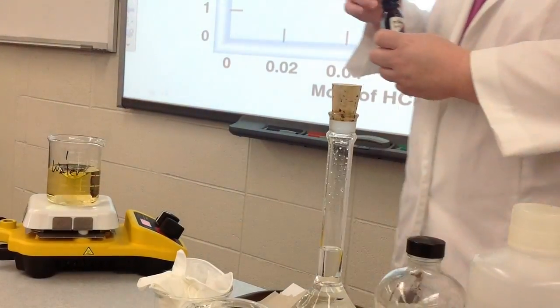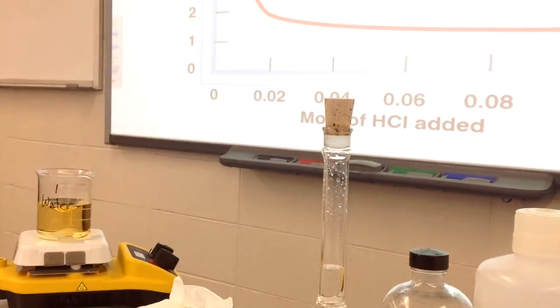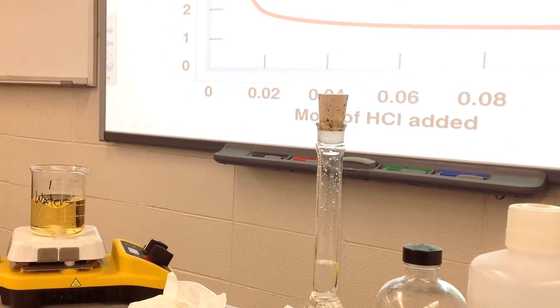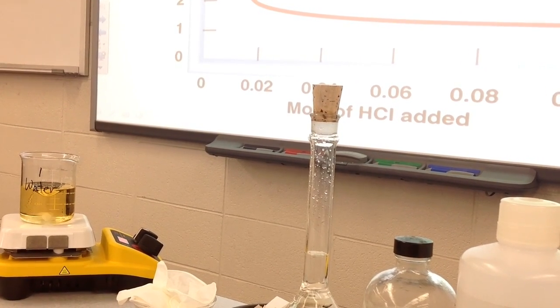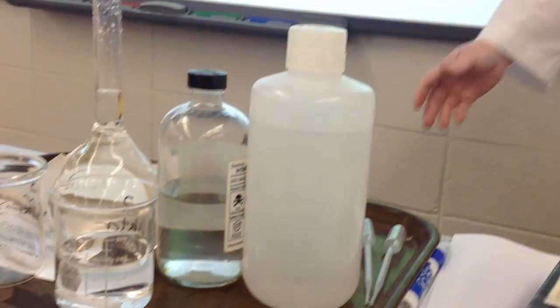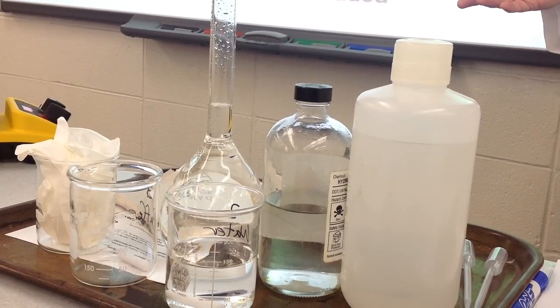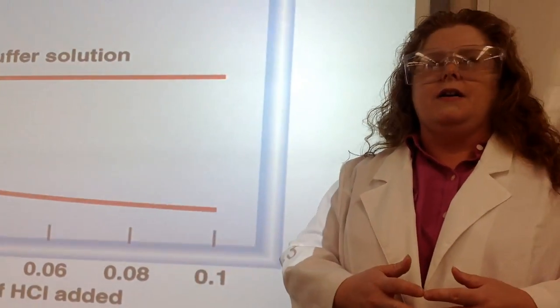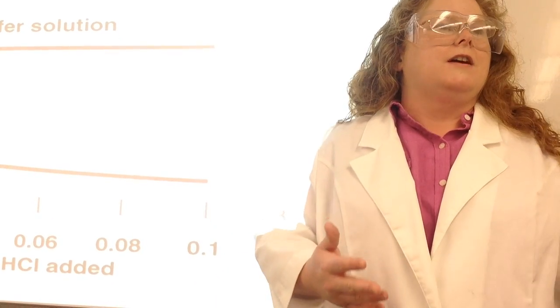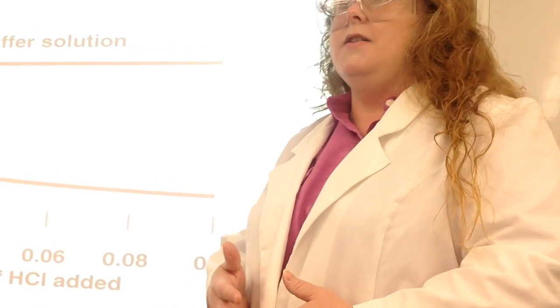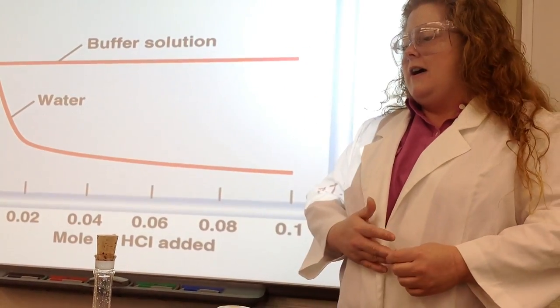You notice that the water now is yellow, and what would you guess the pH of this water would be right now? Okay, it probably is about five and a half right now. This is distilled water, but it has sat open to the atmosphere so any CO2 that's dissolved has made carbonic acid. The carbonic acid will lower the pH below seven, so even though it's pure water doesn't necessarily mean it's exactly the pH of seven.